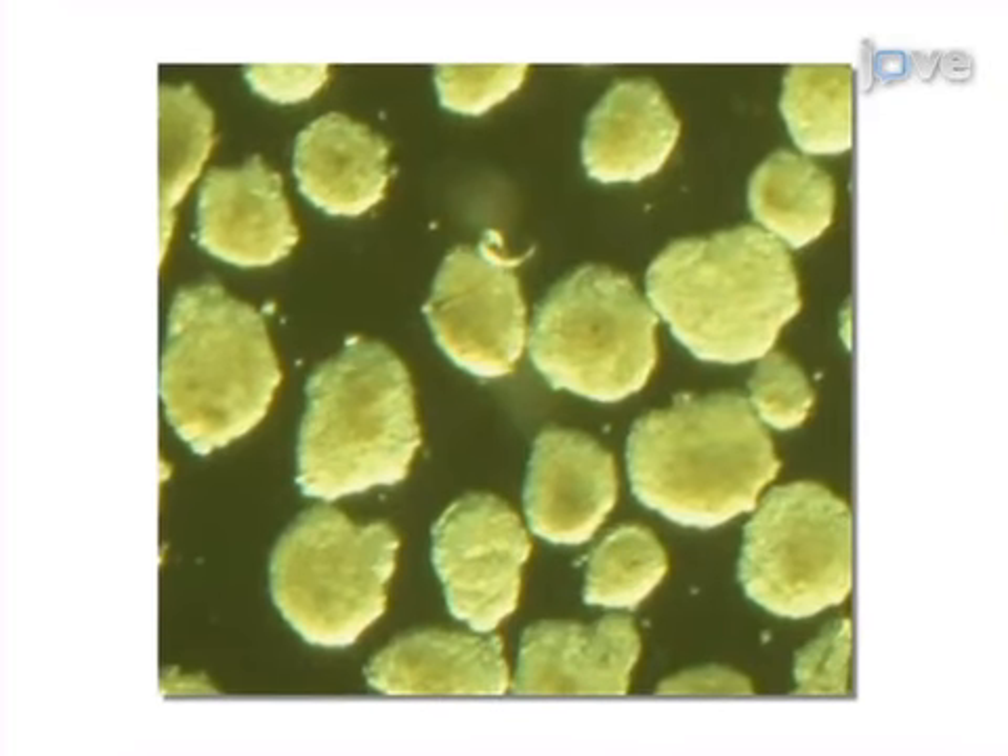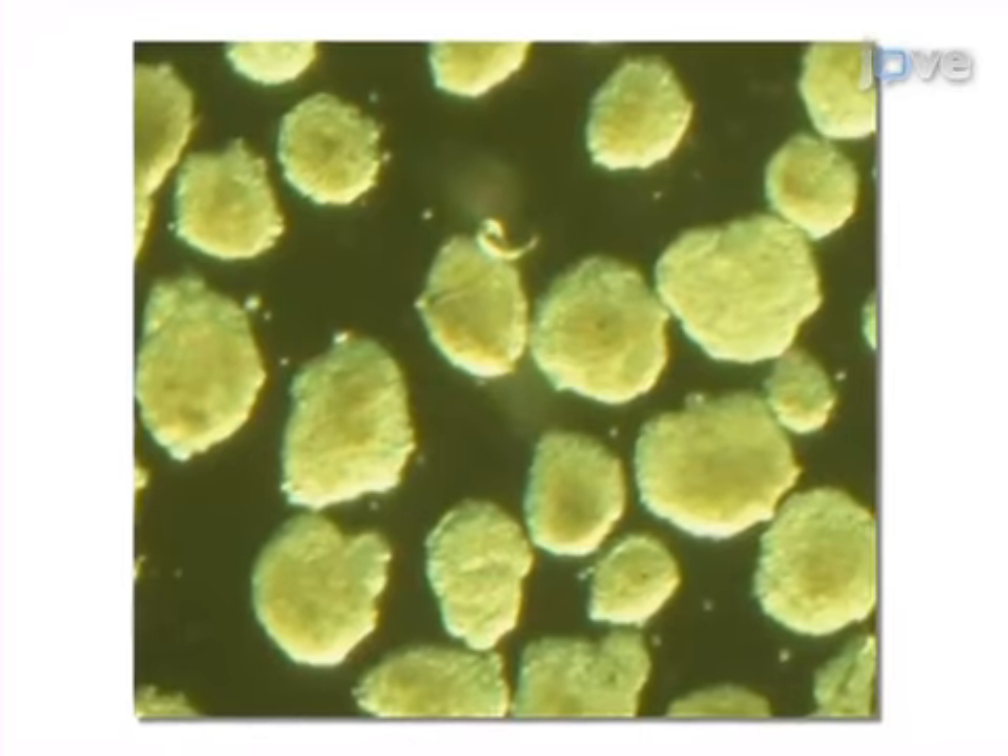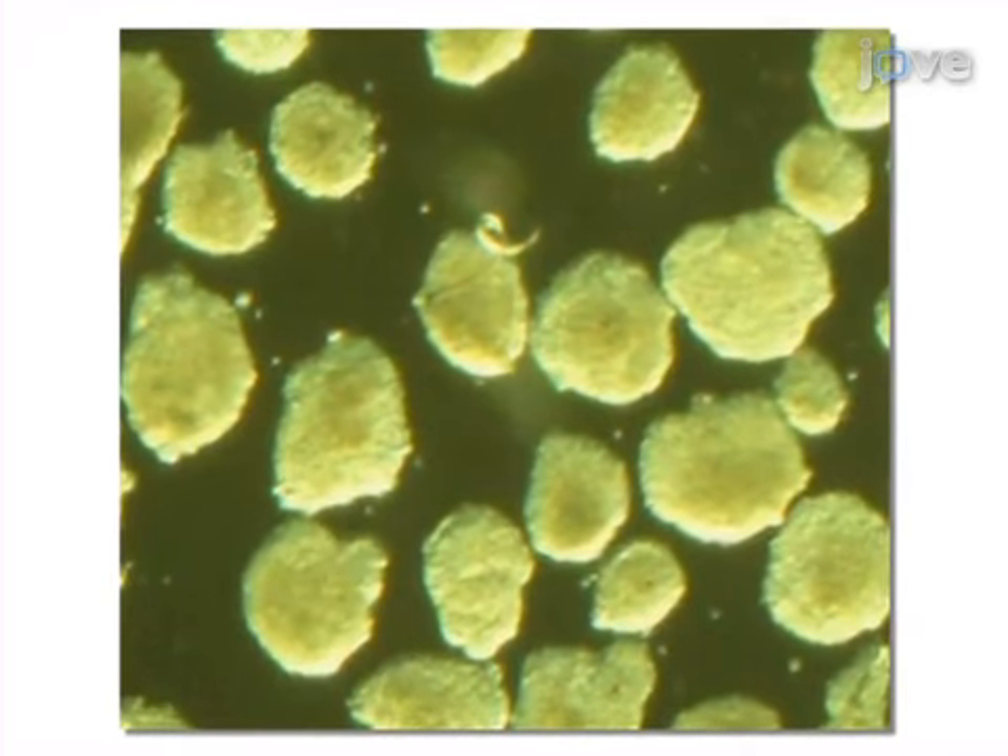This is achieved by first culturing and expanding embryonic stem cells until they form embryoid bodies.